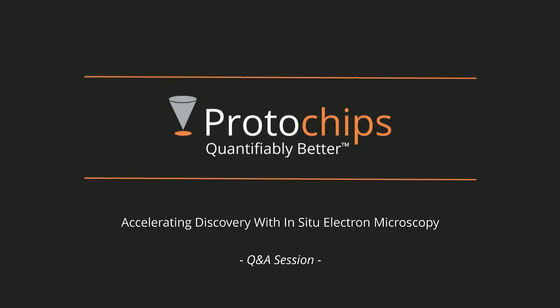That's a great question. So inherently, STEM imaging, since you're taking a finely focused STEM probe that's atomic size and scanning it through the material and rastering it, is a little bit slow process. We don't have really fast dynamics. We're working in the microseconds per pixel time resolution. So per frame, to get atomic resolution where you can easily see all the atoms, it can be between 1 and 4 seconds per frame.